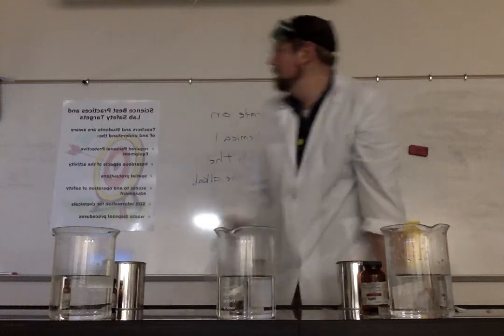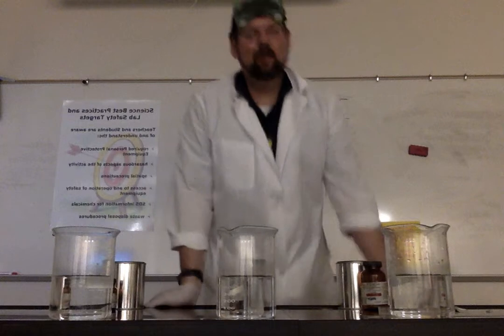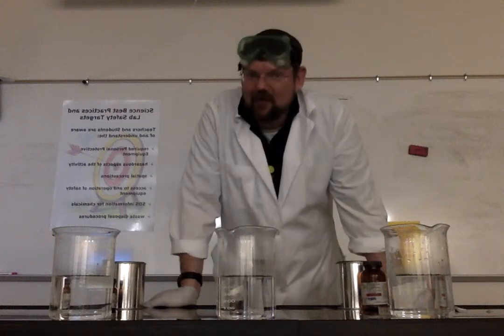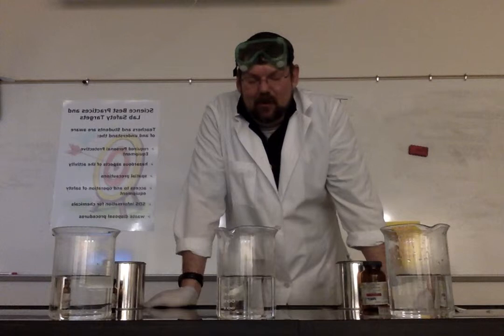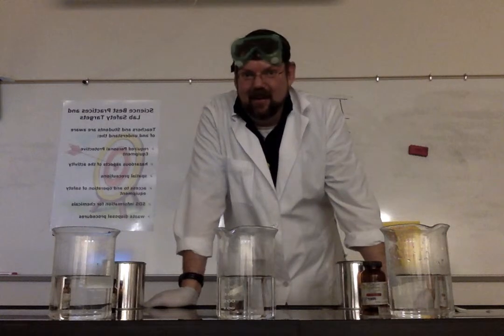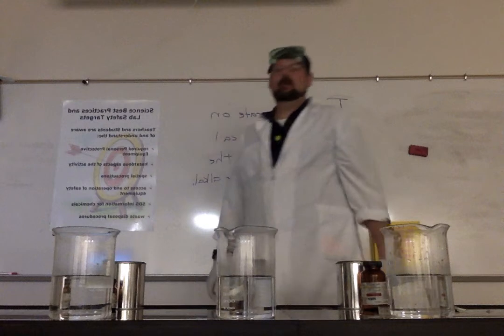Okay. Next, the hazard aspects of the activity. What exactly does that mean? Well, it means stuff can blow up. That's why we're here. We're having fun. Hopefully, we won't get too big of an explosion, even though I know that's what you're hoping for. We should be able to control it, understanding what we're working with. That's why I'm working with it and you're not. And access to and operation of safety equipment.